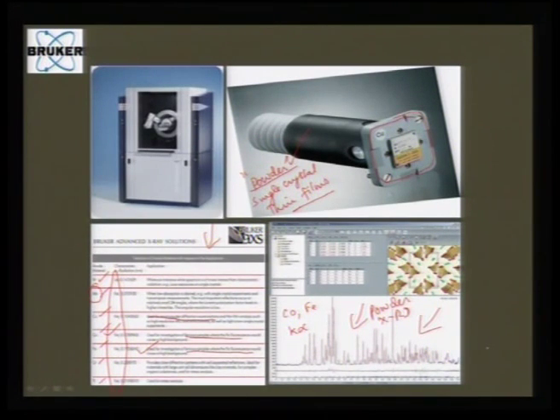So, just by looking at a typical 2 theta scan, you can guess what sort of crystal symmetry you are looking for. The more the peaks, the more complex the symmetry, and therefore, just looking at this, you can say this should be a monoclinic or a triclinic symmetry.